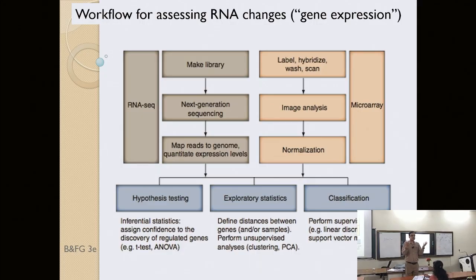So you have got the RNA-seq data from them, and you can train a machine learning model on this data. The machine learning model will learn these differential patterns of transcript abundance representing different cancers.